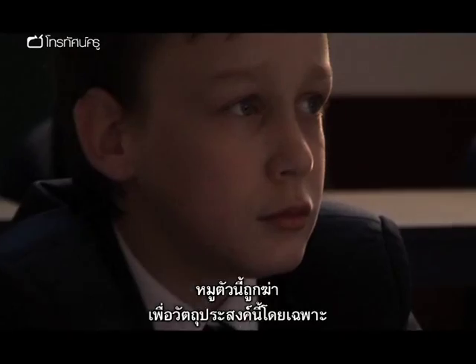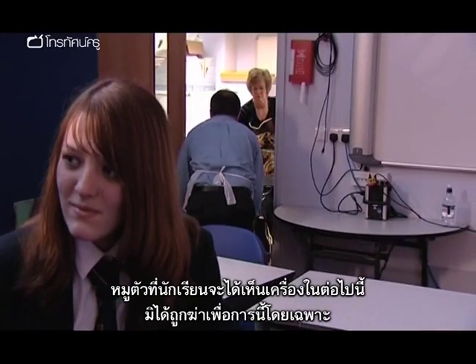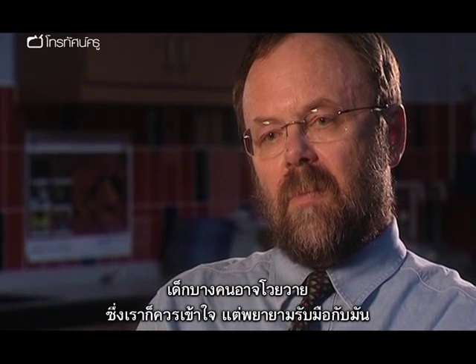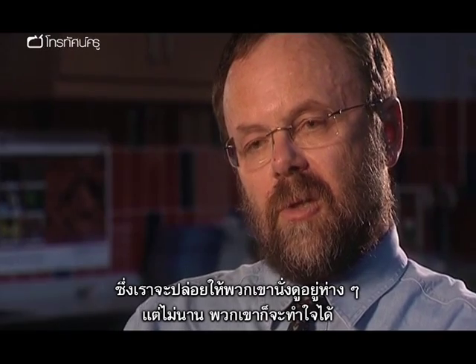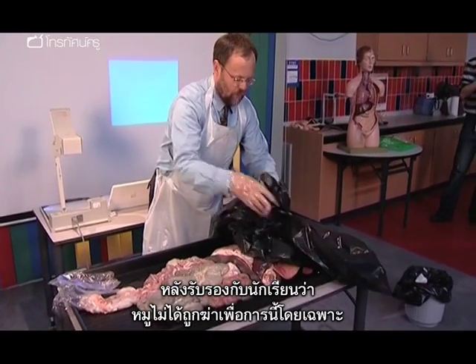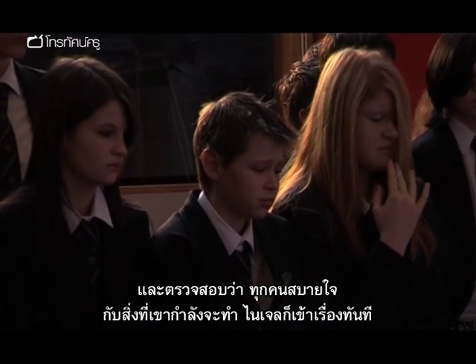"This animal was not killed deliberately for this purpose — the whole biology department's policy is we don't do that." It's very important that Nigel establishes this with the students. It's always important to have a good awareness of their sensitivities and any religious issues associated with using these particular animals. Some children might be squeamish — you respect that, but try to coax them out of it. Very often you allow them to sit on the sidelines, but they pretty soon get sucked into it.